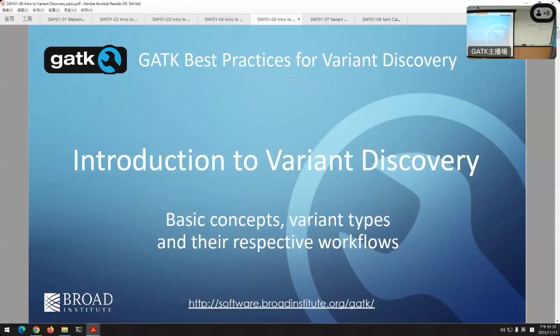Okay, so for the next hour, I will talk about variant calling. I'll give you an overview for half an hour and then specifically talk about germline calling. And then we'll go into a hands-on exercise with those notebooks that you cloned. Aaron will walk you through variant calling with the HaplotypeCaller. You'll get to do it yourselves.